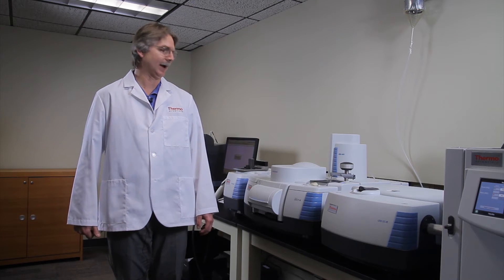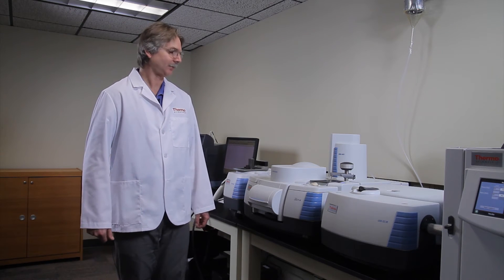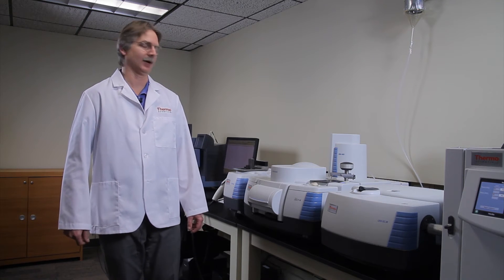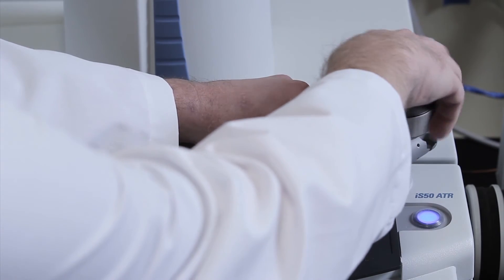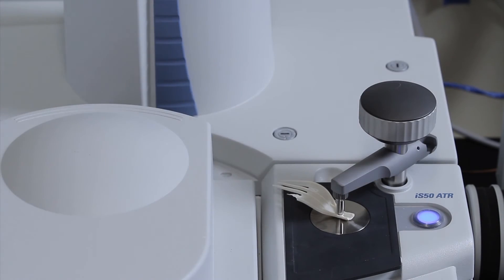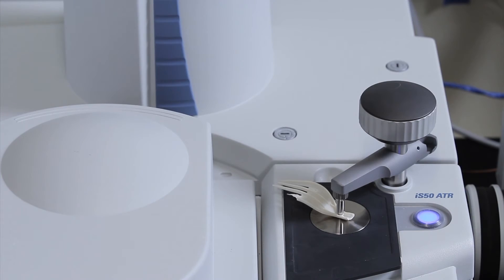With the IS-50 set up to do far-infrared analysis, all I have to do is push the button again to collect the background of the far-infrared. Once the background is collected, we can put the sample again on the ATR and collect the spectrum. Put the sample on, turn the pressure tower down until it clicks, and push the button to collect the data. In just a few seconds, we'll wind up with spectra in the far-infrared region.